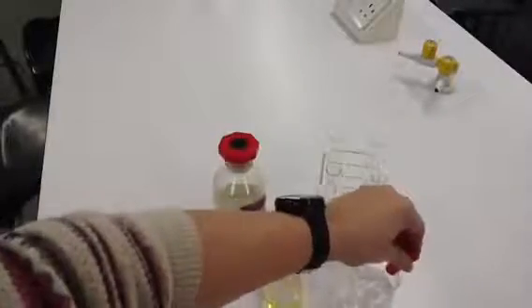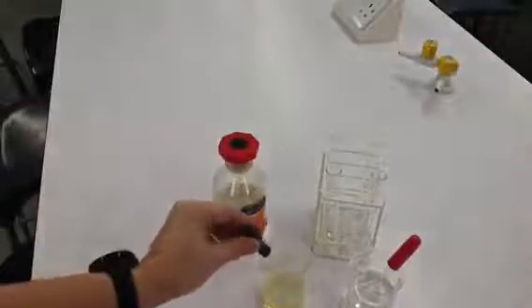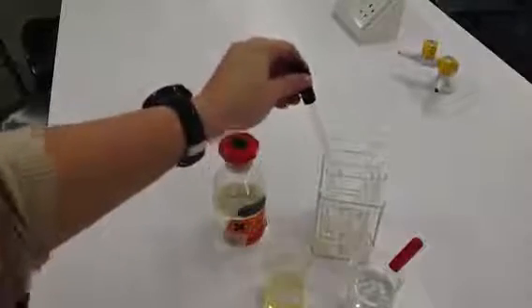This is the test for lipids, which sometimes is called the emulsion test. So we have two samples again. So we have sample A and sample B. And we just place a sample of both of these into different test tubes.